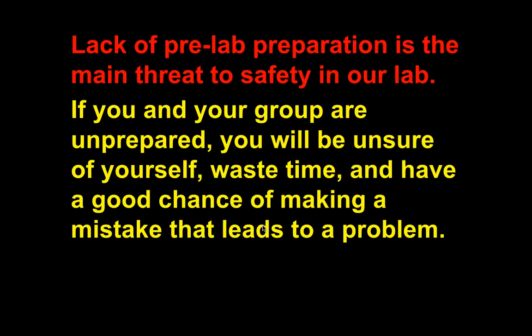Lack of pre-lab preparation is probably the main threat to safety in our lab. Sometimes I'll assign a reading and the next day we do a lab where you need to know what you read. If you're not doing the readings, how are you going to do the lab? If you don't keep up with readings and homework, you won't be doing labs — I'll have you do alternatives. If you're not behaving or taking quizzes seriously, you will be pulled from labs for safety reasons.